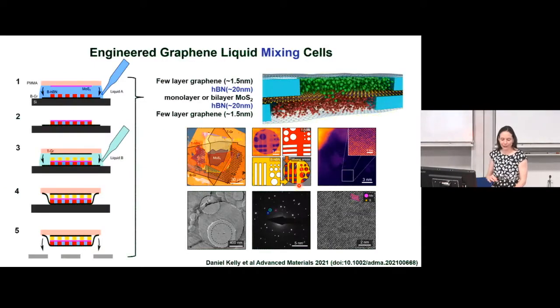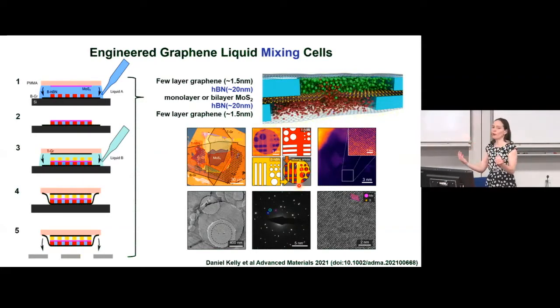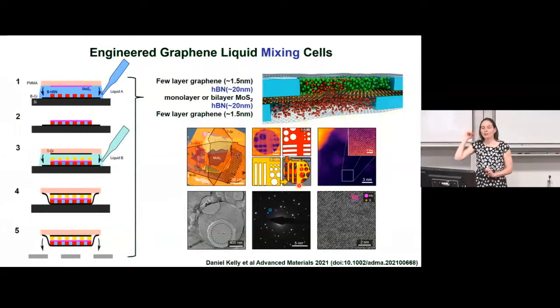Okay. So this is now our graphene liquid cell, and rather than just having 1 pocket of liquid, we've put 2 pockets of liquid, and we've stacked them on top of each other. So we have a pocket of liquid which is full of green atoms and a pocket of liquid that's full of red atoms, and now we can do real chemistry experiments, because we can use the electron beam to burst or to pierce the separation membrane that is between those two pockets of liquid, and that causes those liquids to mix inside the electron microscope. And you can watch then at the atomic scale a video of two liquids mixing, and that really is the first time that anyone's been able to do that. I'm not going to go into the details of the fabrication.